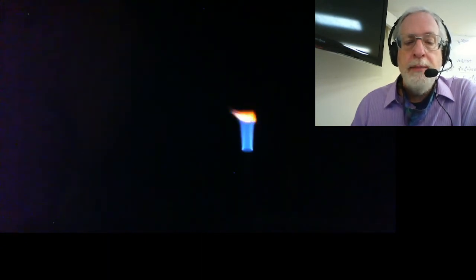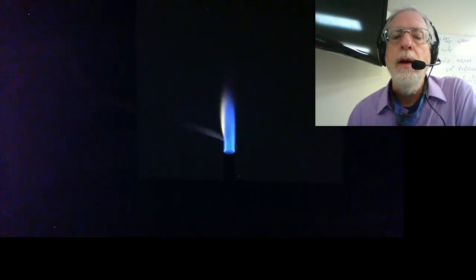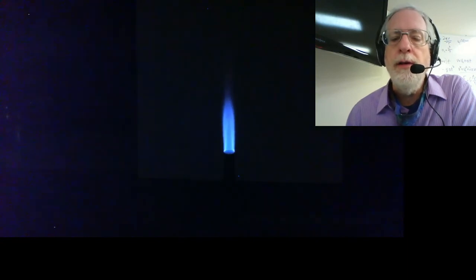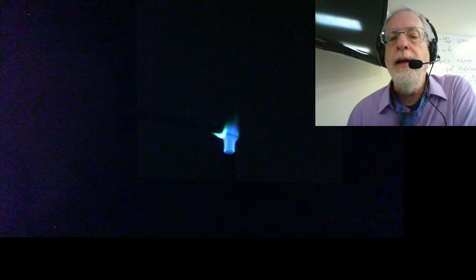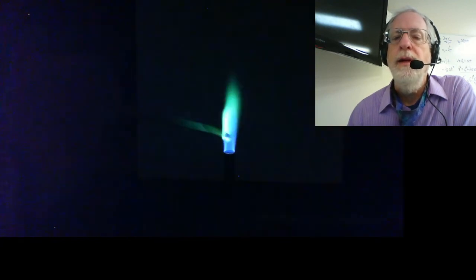Now we go to some I think pretty ones. Barium chloride. Barium chloride has, let me make this a little bigger. And it's getting a little bit washed out because it just looks like it's white. So I'm going to try and find a good place to pause the video so that you'll get the color. And I think I said there was a good thing somewhere in the middle here. Yeah, right about there. You see that color to the left right there? I'm going to play at normal speed through there and then I'll rewind it. Oh yeah, I got a great color reaction there. I'll just keep replaying that right through there. That's barium chloride.